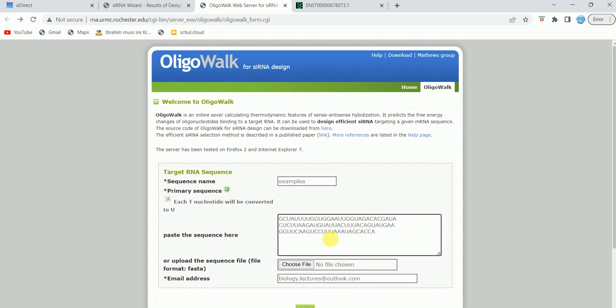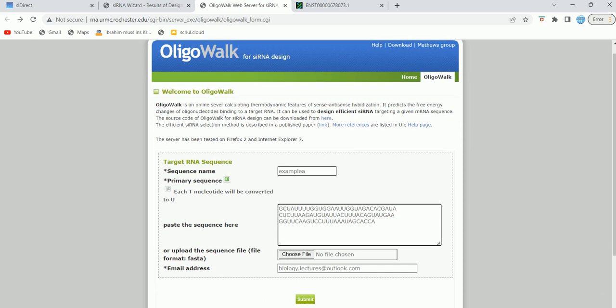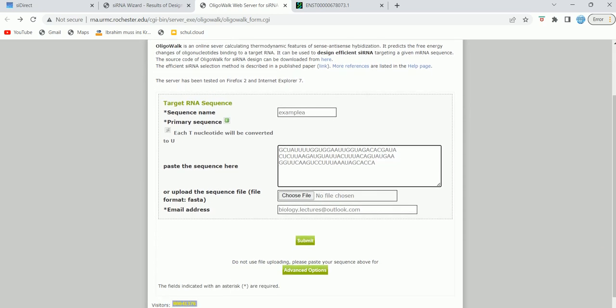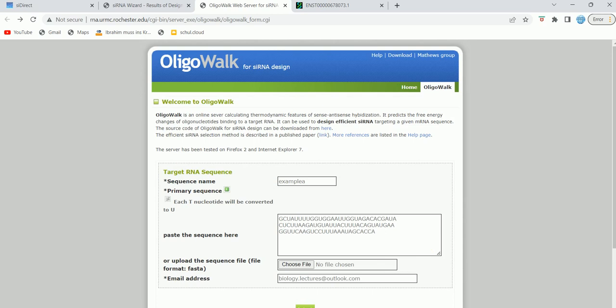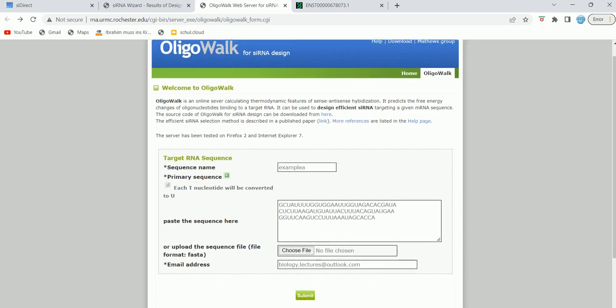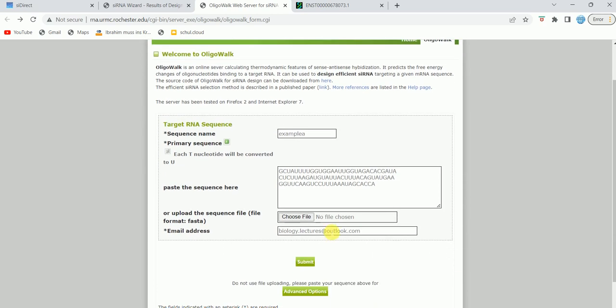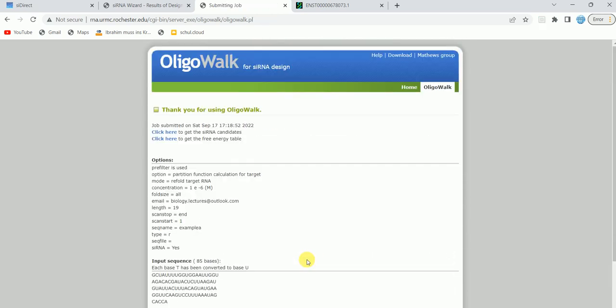For this tool, you can also upload the file. It's very easy. Here, email address—you need to provide the email address. I have already provided biology.lexis. There are advanced options, for example oligo type, RNA oligo length, salt concentration, and non-functional non-siRNA candidates, and so on. There are so many options you can choose if you wish. But I'm just going to go back and then I'm just going to click on submit.